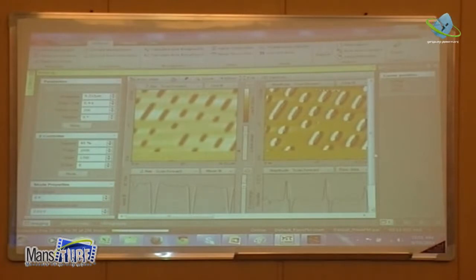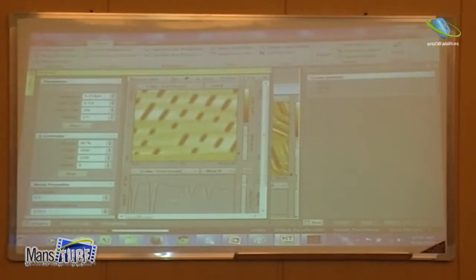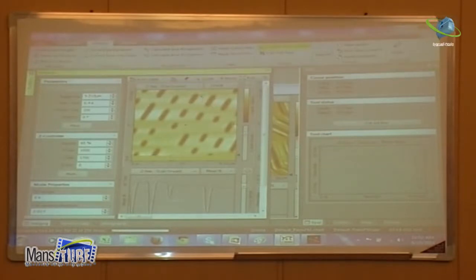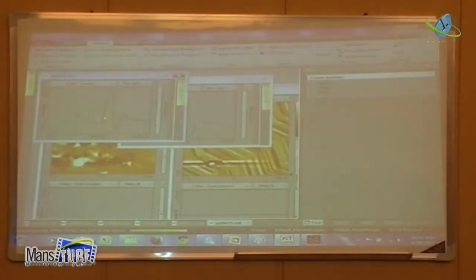I will make this small, and then make this a little bit bigger, so I see exactly where I make the cut. Let's say create cross section. Then here, this is the up, then the lower part. It's more up on this side, and this is the hole, and this is the material around, outside, inside, and outside.